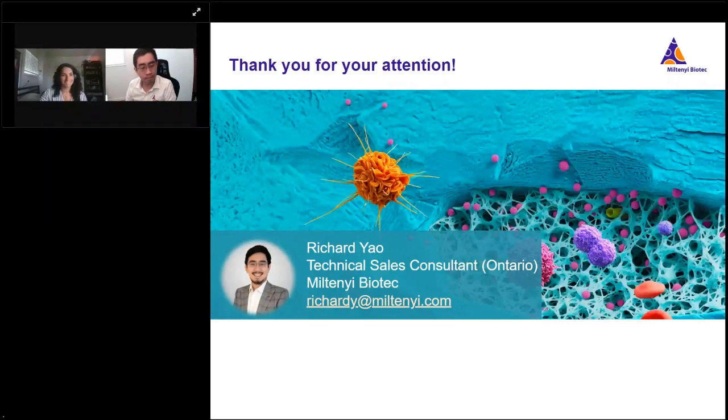Yeah. Very good. Okay, so the second question we have here says, I noticed Miltenyi has 2 CD34 microbead kits. One is called Ultra Pure. What does that mean, and which one would you recommend? So the Ultra Pure, as the name shows, it's ultra pure. So the major difference is that it's providing an ultra pure result. But what exactly that means, I guess that is more your question: why we call that ultra pure and how does that work?